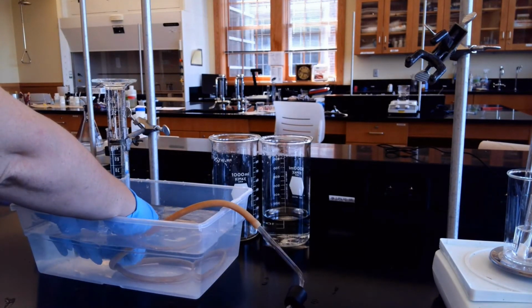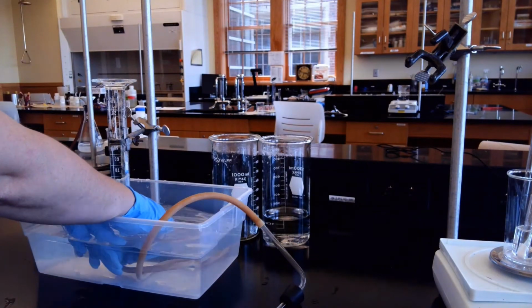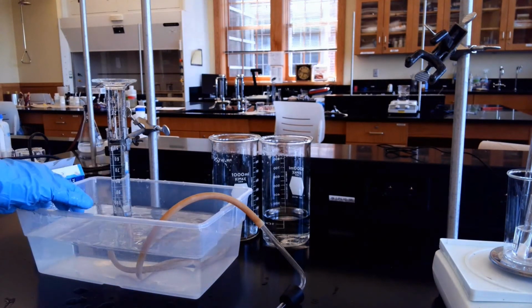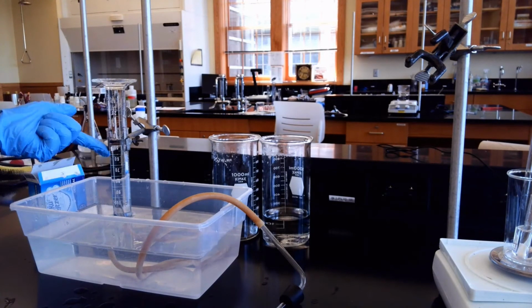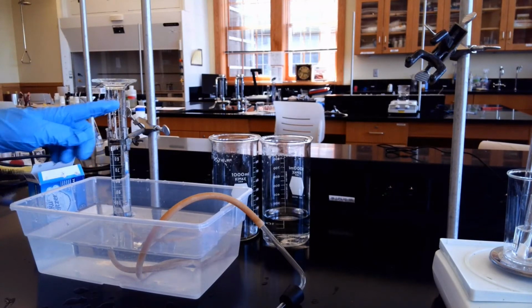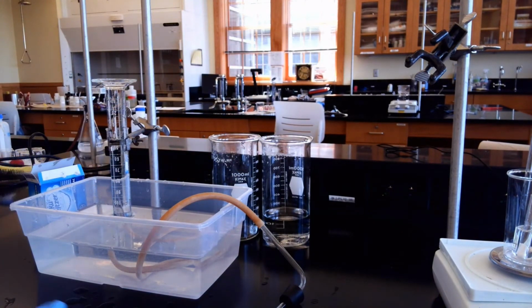So we're going to stick it in just like this, and we are good. And what I'm going to do is have some extra water ready to go. So remember what's going to happen, as the CO2 is generated, it's going to go up the graduated cylinder and it's going to push the water out. And we'll use some of our extra water here to make sure our levels are even.